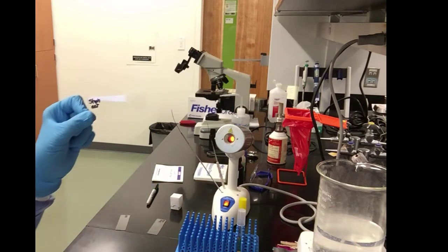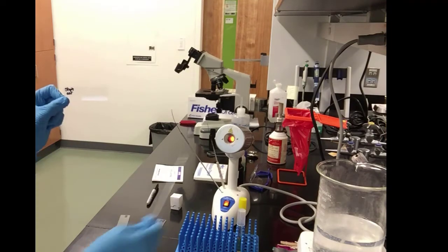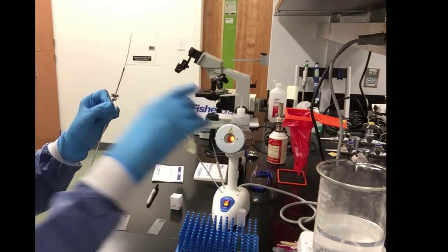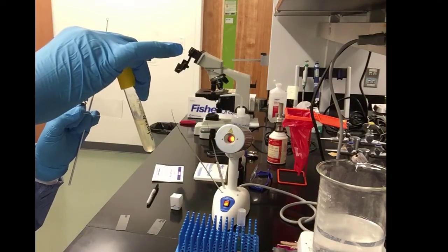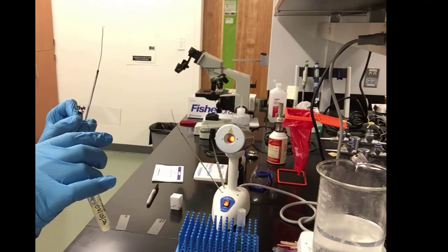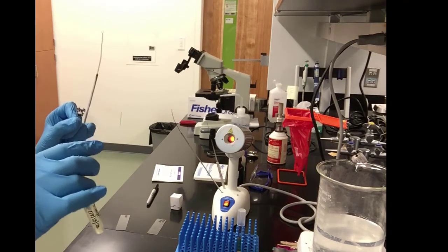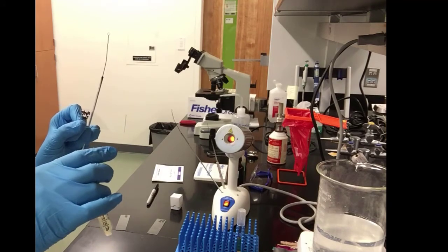So we want to take our loop and first put a drop of water and then smear the staph into the slide. And you can see here it's on a slant, so it's going to be a very concentrated smear if we put it directly onto the slide. So for this reason we will use a drop of water.